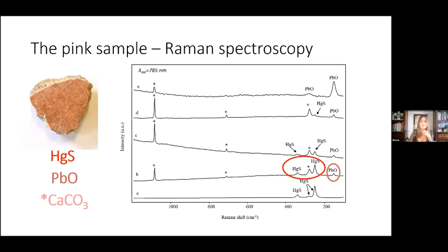It should also be noted that different features were achieved moving from one grain to another over a small scratched area of the sample. It must be stated that the signatures of litharge were hardly detected on the sample. In fact, mainly the bands of cinnabar and calcite were observed, and this led to thinking that the litharge layer was an underpainting under the cinnabar one.